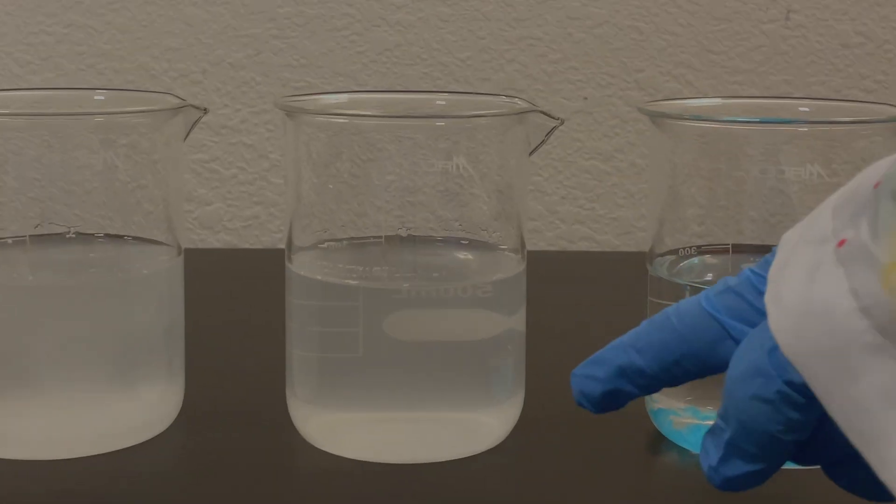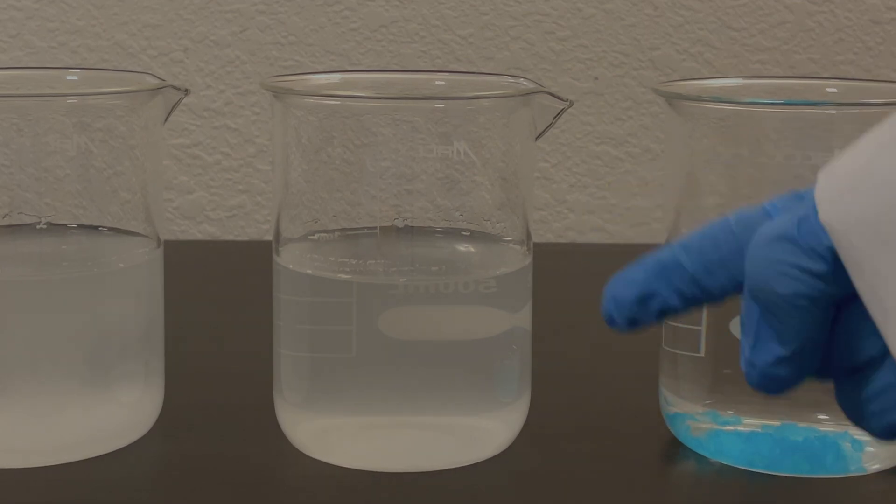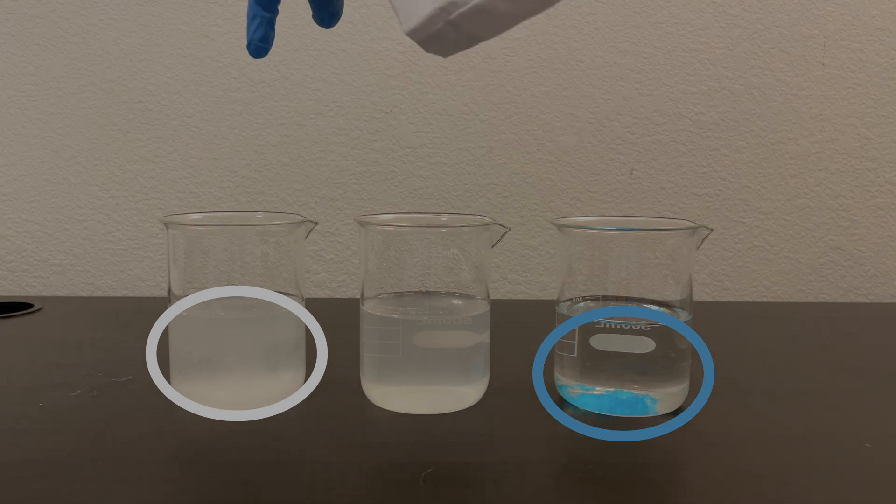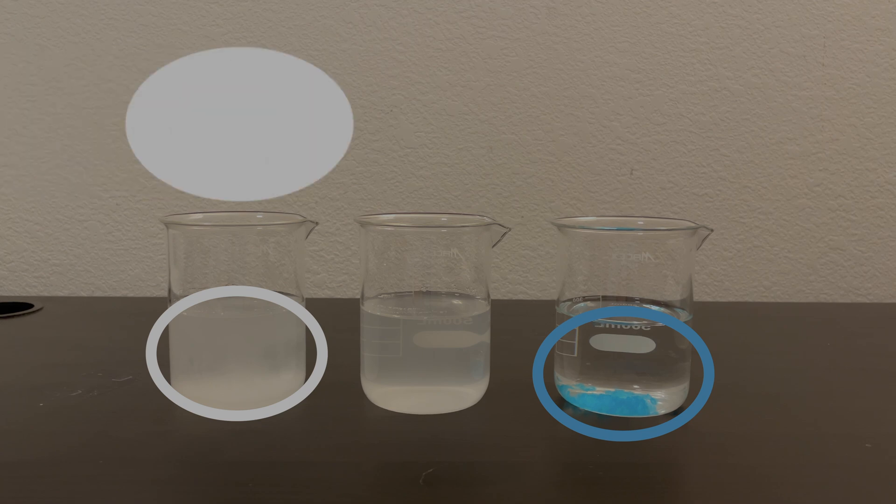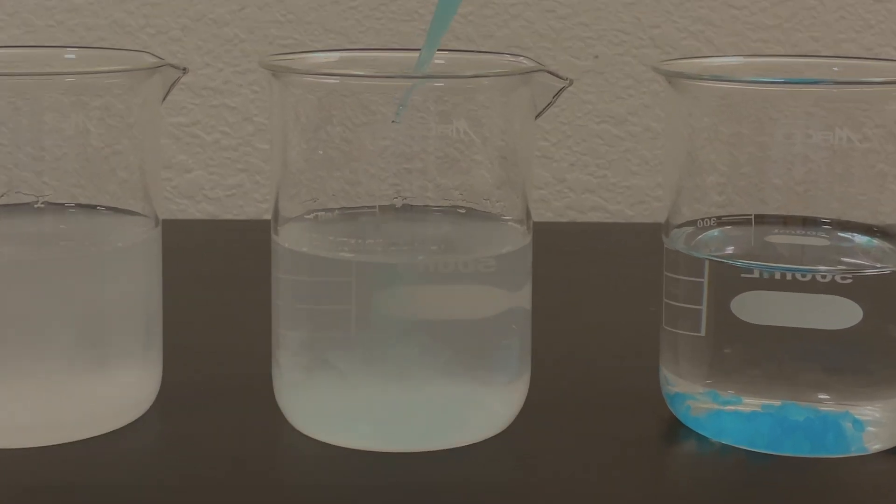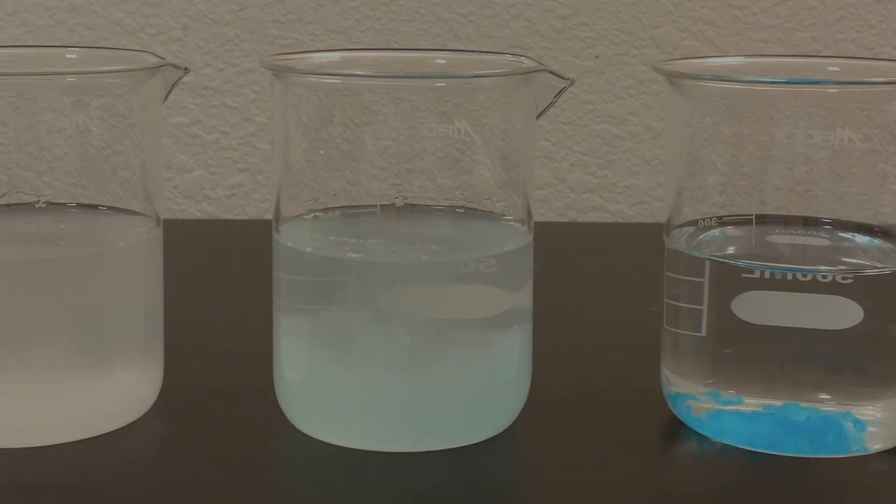Now, in this middle beaker, I'm going to create a third solution that will contain a mixture of the two precipitates formed in these other two beakers. If you understand color wheels, since I would be combining a white solid with a blue solid, you might expect that I would get a light blue precipitate. In fact, you would be correct.